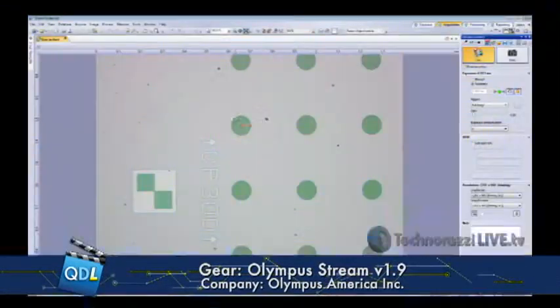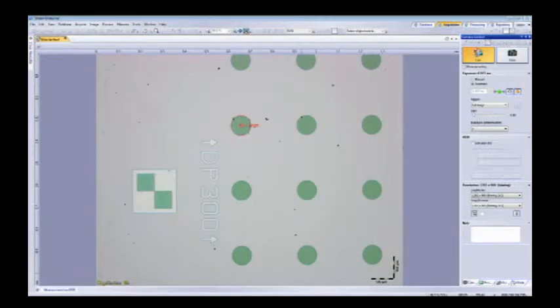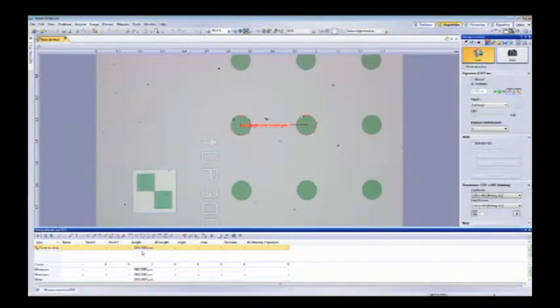We can come out here and mark 3 points of a circle and move over and mark 3 points of the circle that you want to measure the length to. And now it's showing the length right on the image, and all of these manual measurements can be exported to a workbook, then out to Excel or embedded into reports, transferred right into your PowerPoint. It's storing this also onto a table in the software right down there. Okay, yeah, so your features pop up down there. We also put in a new angle ruler. This allows you to bring a ruler out onto the screen and determine specific angles of things. So that's some of the manual measurements and add-ins that we've added from feedback out in the field.